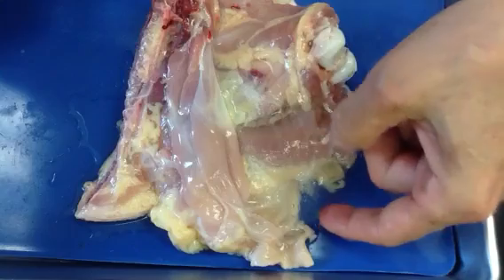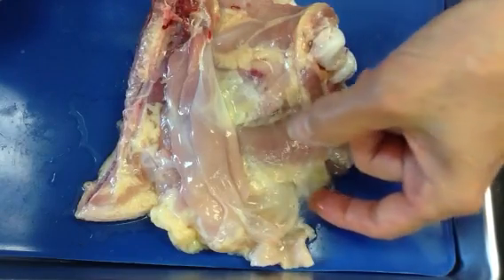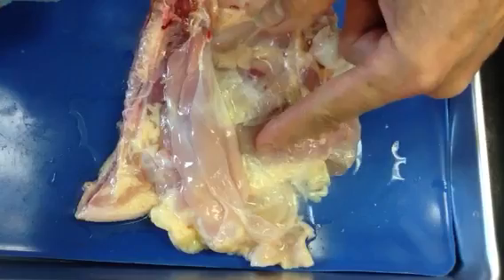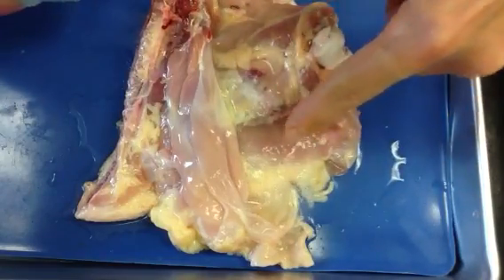We just ran some water, and we can see that this loose connective tissue trapped water underneath it and air bubbles. That's why we're seeing some whiteness in here now. It looks like a jellyfish, kind of.